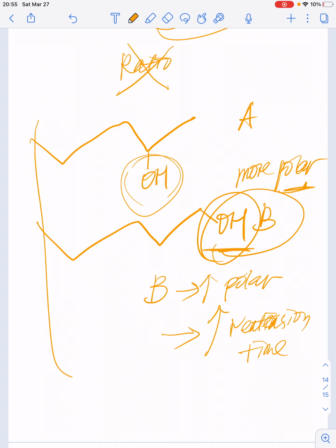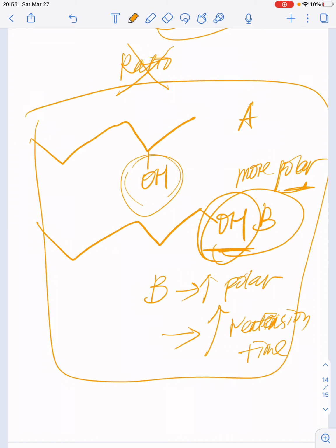Okay, and these are all the same. So think about it before you assign protons and before you do analysis. That's all I can think of for the post-lab analysis. And make sure to assign those, because there are going to be points assigned for correctly assigning your products to the GC peaks. Okay.